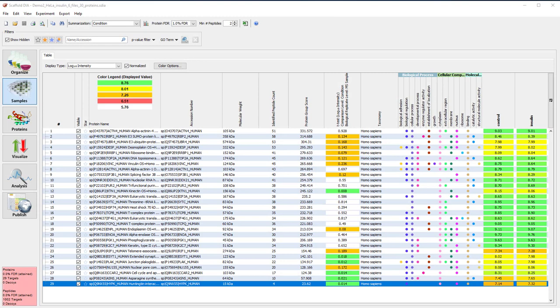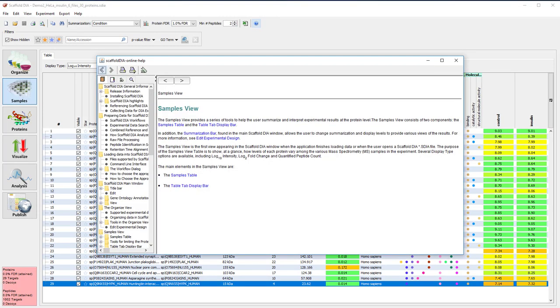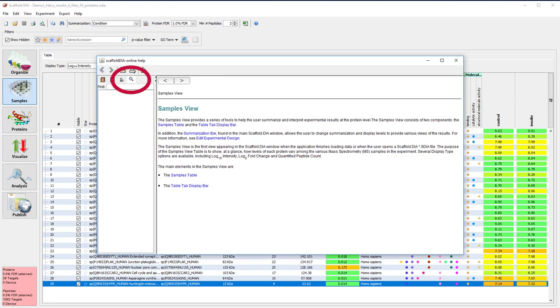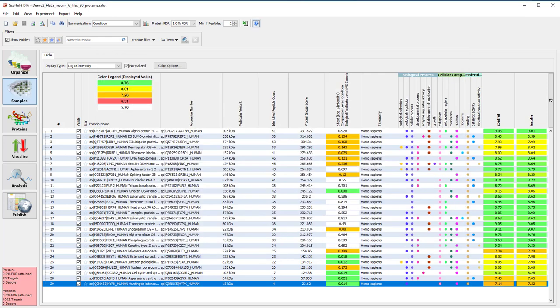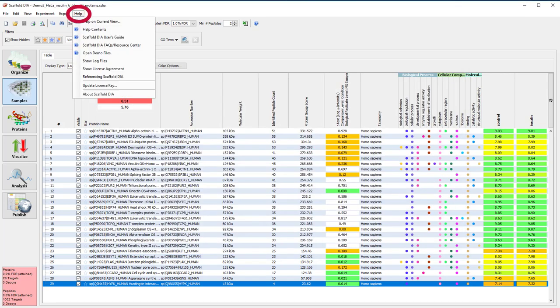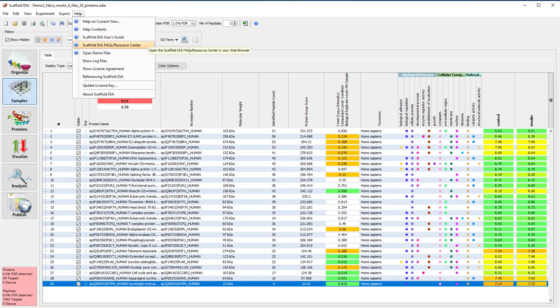The blue question mark buttons distributed throughout the program will take you to a queryable version of the Scaffold DIA User's Guide. Click on the magnifying glass icon to search. The Help drop-down menu contains links to the Scaffold User's Guide and our Online Help Center.